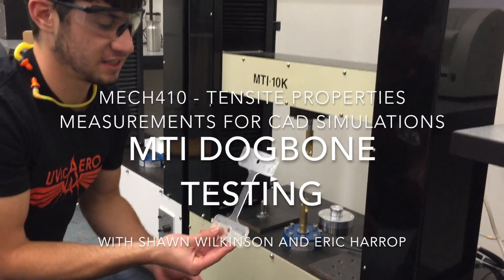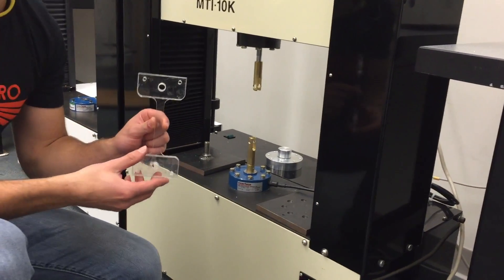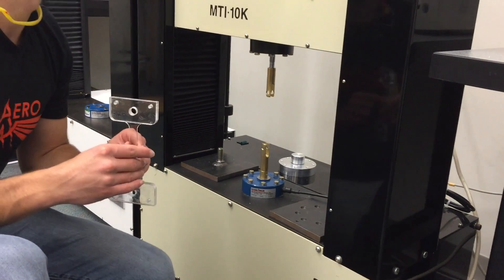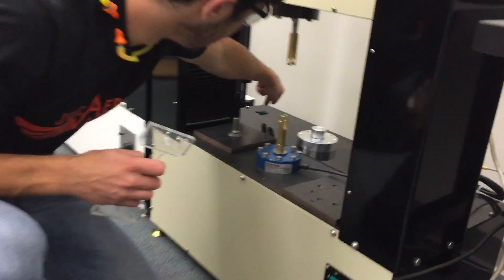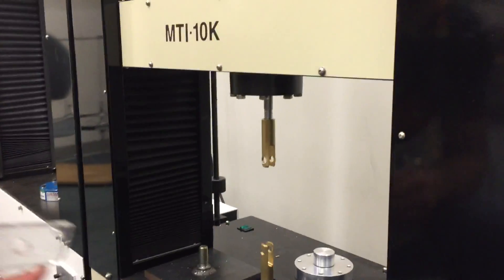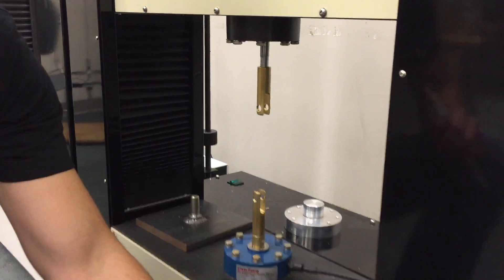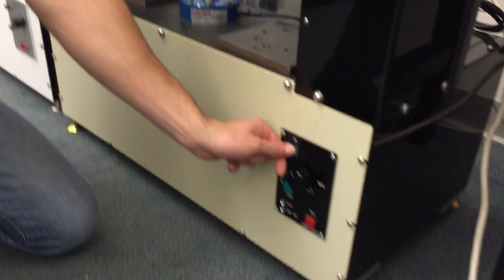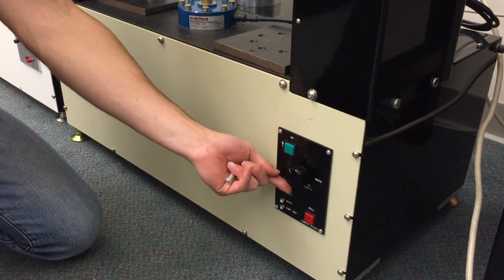This is the test specimen that we'll be conducting the test on today. To turn on the machine, we flick on this green switch back here. The machine's now on and we can press the arrow keys to manually control the machine.